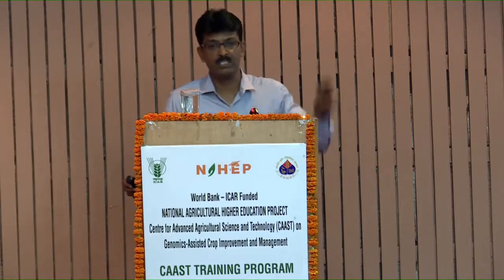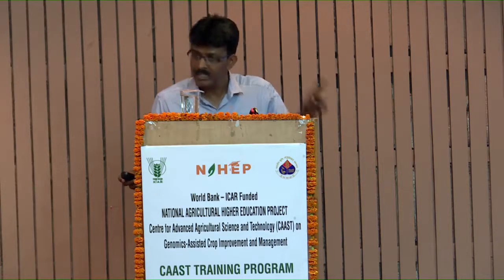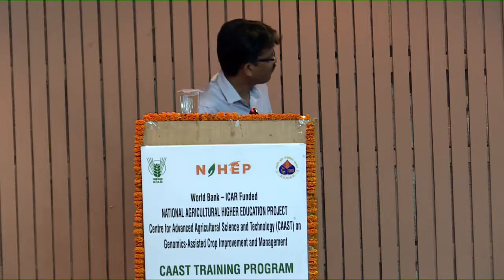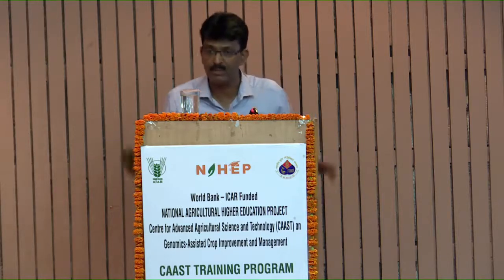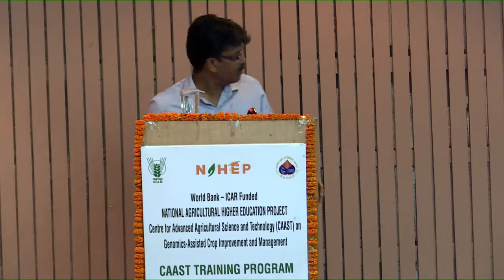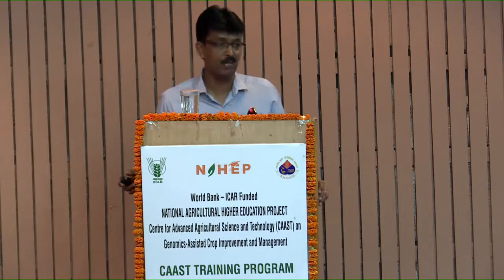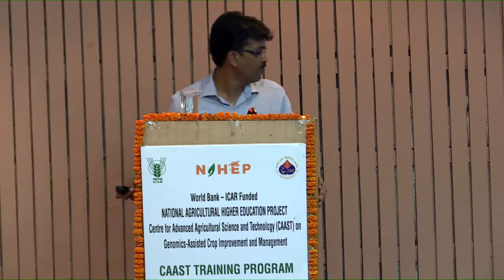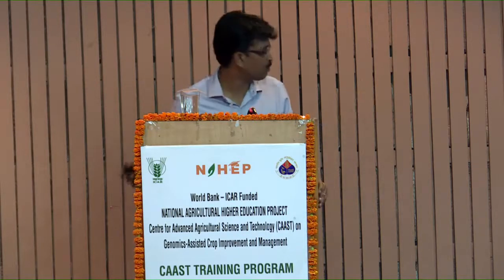So I make another point here. Two detection methods are there. One is the dye-based one, another one is a probe-based one. When I talk about the dye-based one, it is less expensive and quite easy to perform in any laboratory, right? Of course, the disadvantage of this dye-based one is, I already highlighted, it is non-specific. Why is it non-specific? Let's take some example. Remember, SYBR Green is not all alone. We have a number of other dyes in the market. You can buy any one of them. For example, you have SYBR Green II, EvaGreen, LC Green, PicoGreen, YO-PRO, the Cyto family, and the list goes on, right? And of course, SYBR Green is the most popular one.